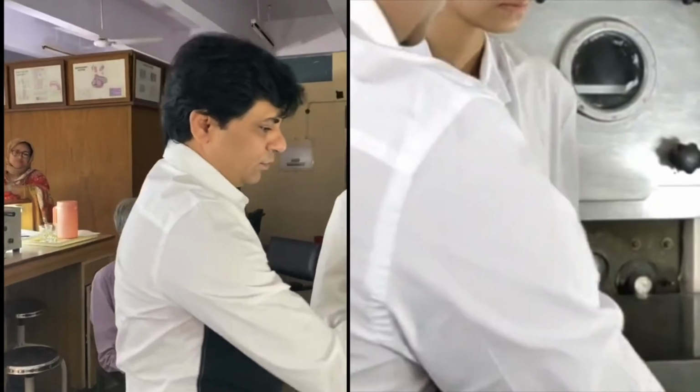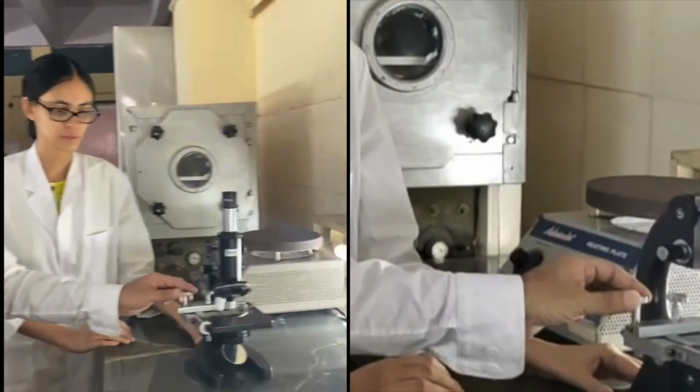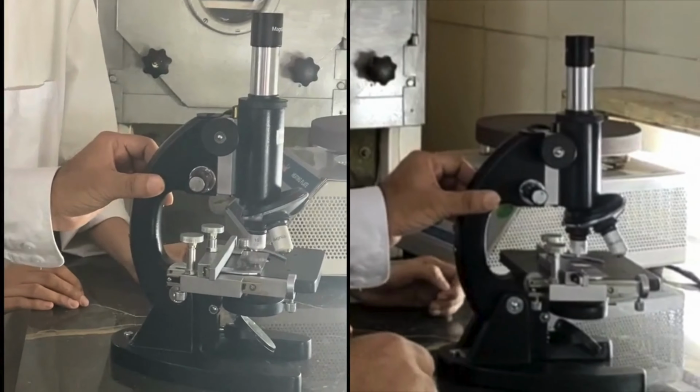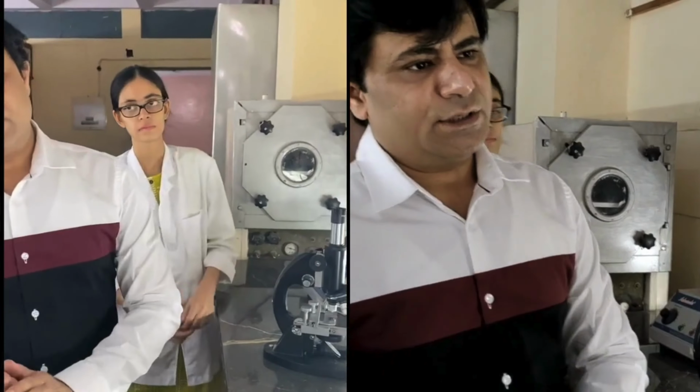Okay, so this is how we need to fix the slide with the help of these stage adjustment buttons, right? And everybody knows, I think even undergraduates know how to focus a slide. And you can see the tissue.